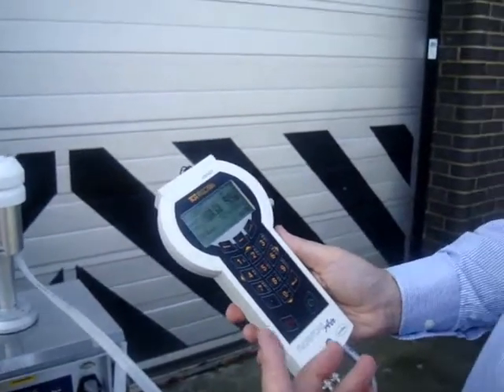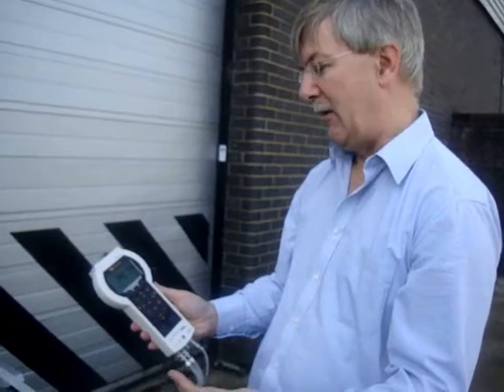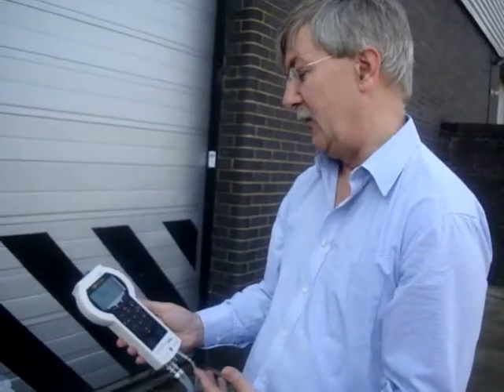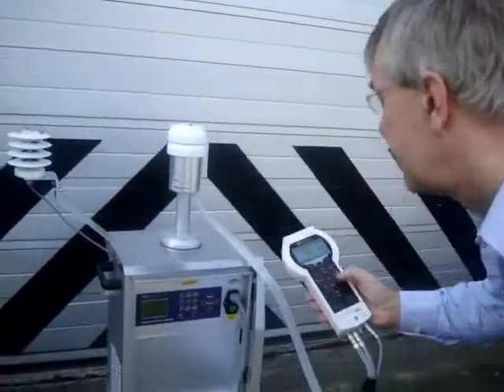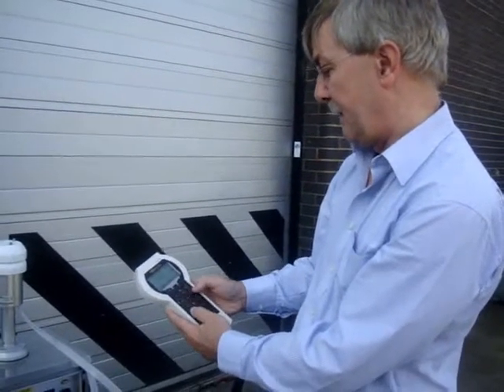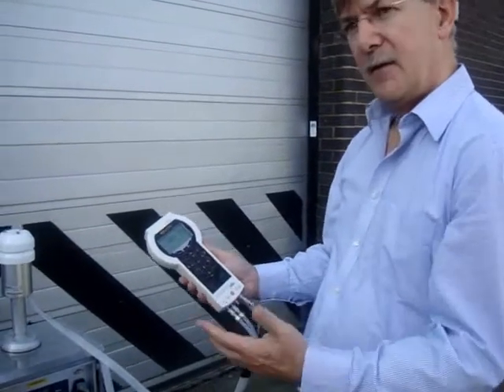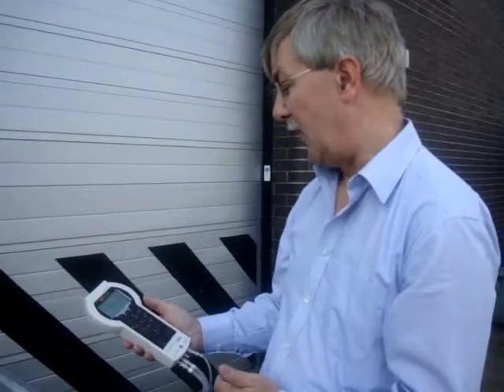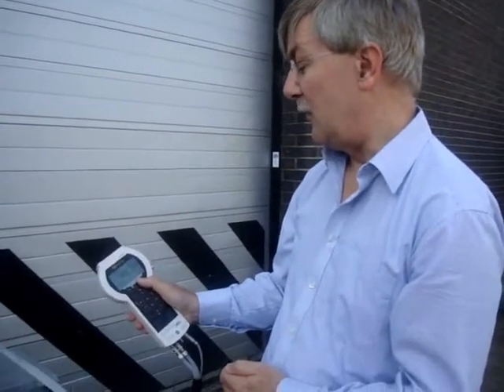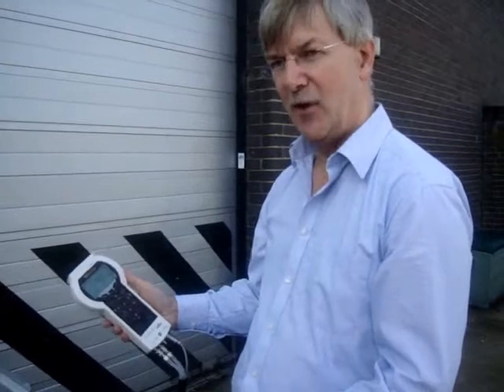To verify the stability of the flow rate over an extended period of time, we may wait a short period and then record another value. The same sequence can be repeated a number of times to store values and demonstrate the stability of the flow. When the test is completed, simply pressing done stores the data on the internal memory of the device.